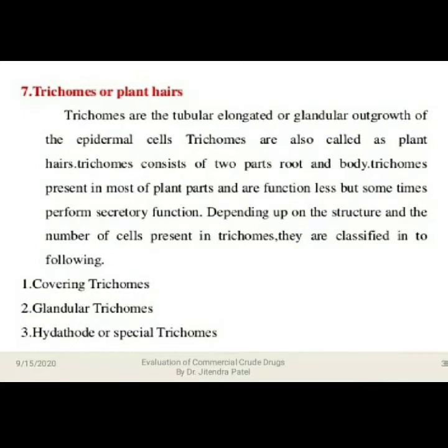Coming to the trichomes or plant hairs. Trichomes are the tubular, elongated or glandular outgrowths of the epidermal cells. Trichomes are also called plant hairs. Trichomes consist of two parts, root and body. Trichomes are present in most of the plant parts and are functionless, but sometimes perform a secretory function also.